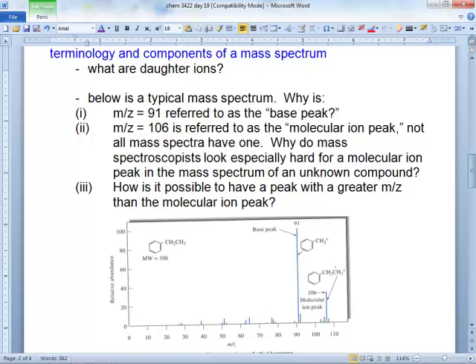But the absolute intensities could be different because somebody's detector could be a lot newer, more efficient, or the sample could be more concentrated, right? Those intensities are going to be all over the place. But the relative abundance fingerprint, right? Same for everybody's. So that's a good question. I should have that in there somewhere.